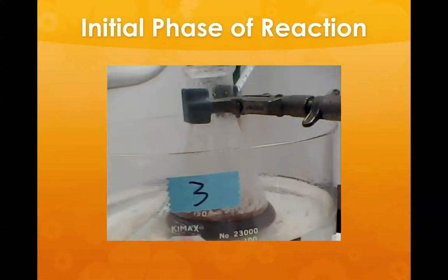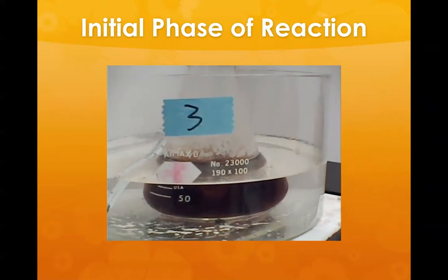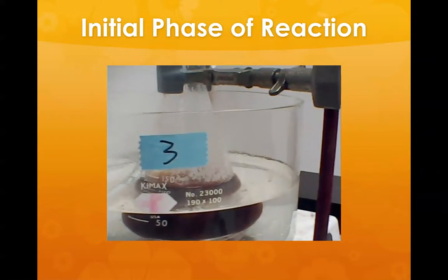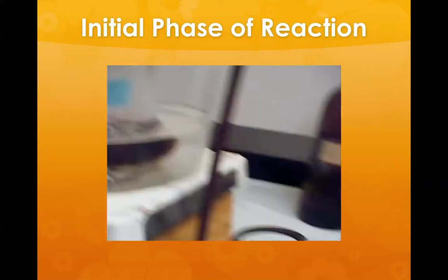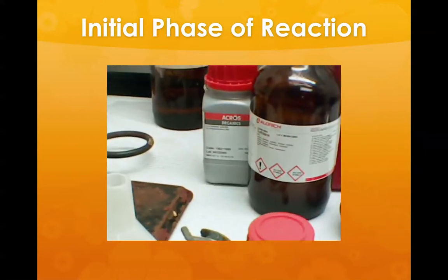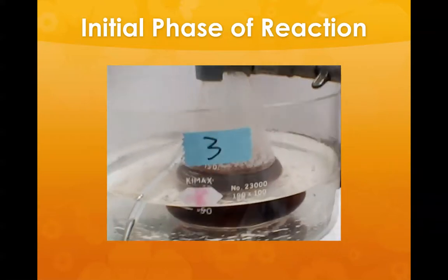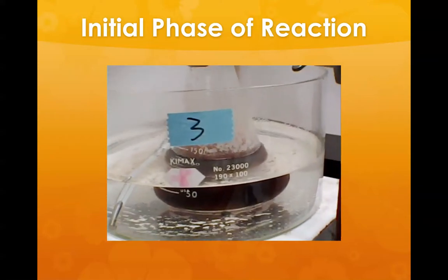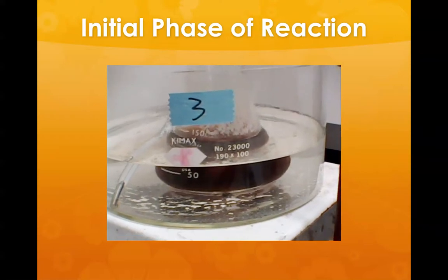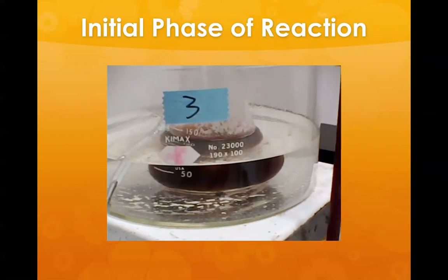I have a student working with me, Cassidy Cora, and he'll be graduating in chemistry in a few weeks. He's working with me on this project. We're making proteinoids, synthetic polypeptides, and after a short period of time at this temperature, we will be adding the second amino acid, glycine, and then a third amino acid, a certain amount of L-histidine. Our objective is to make so-called proteinoids, and my colleague Dr. Singh, a microbiologist, will be determining if these thermal polypeptides are metabolized by selected microbes.